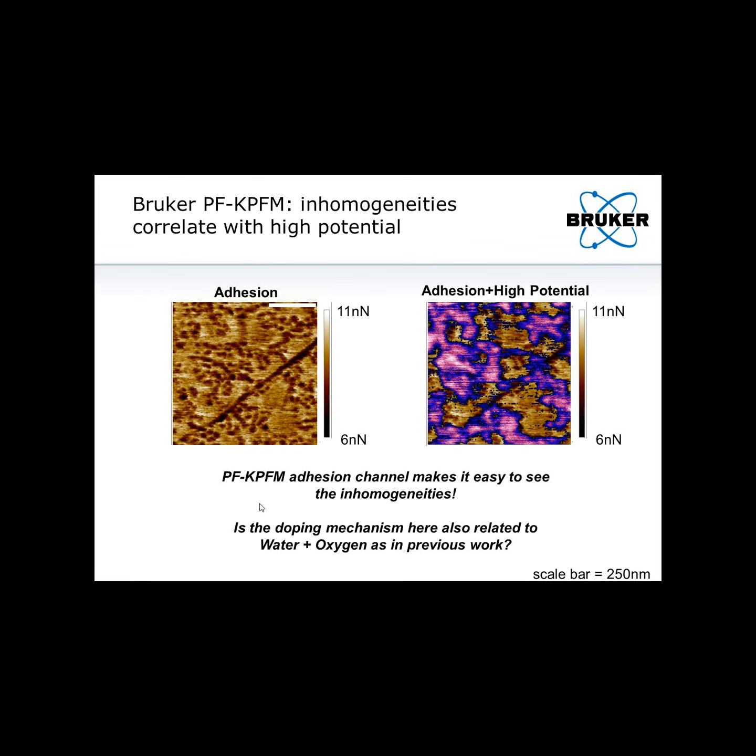So this also raises an interesting question. What is the doping mechanism for these regions? Is it related to water and oxygen, as was thought previously by other researchers? Because if this is some sort of residue, maybe this is a different type of doping mechanism.